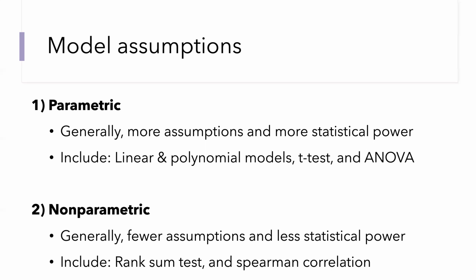Despite having more assumptions, these models are oftentimes the right tool to use if we have only a couple of replicates. And because the non-parametric models will not have sufficient data to identify differential abundance in most cases where it does exist.